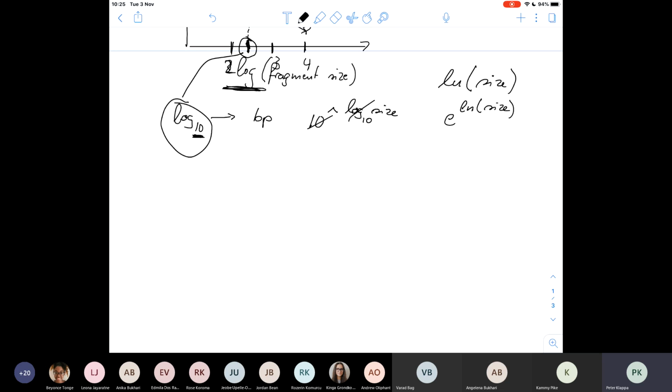And I think I have an exercise on the website that I emailed you about the DNA gel electrophoresis. So that was DNA, right? And you will do a practical with my colleagues soon, where you create DNA fragments and where you need to find out, are they of the expected length? And that is the way you do it. You use DNA gel electrophoresis, and the fragments will move, and then you have to find out what is the fragment size.